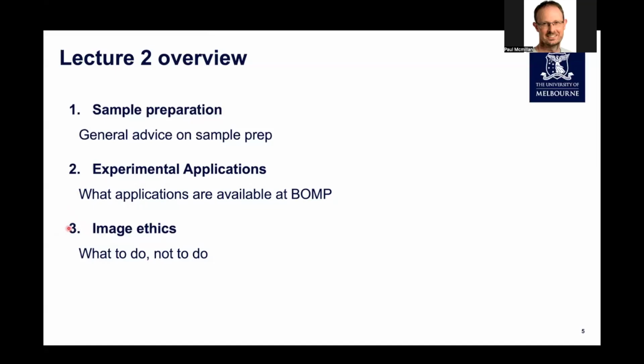Finally, we'll go through a little bit on image ethics. Once you've generated your data, what should you be doing to it? What's ethical, what's not ethical? If you have any questions at any point, feel free to put them in the Q&A section of the webinar, and I'm happy to answer those at the end.